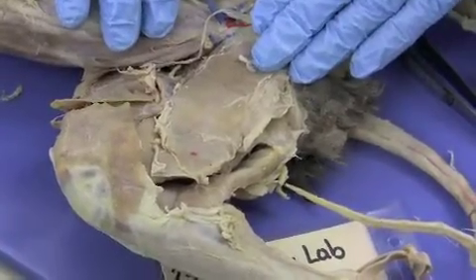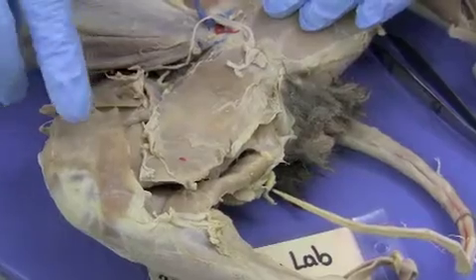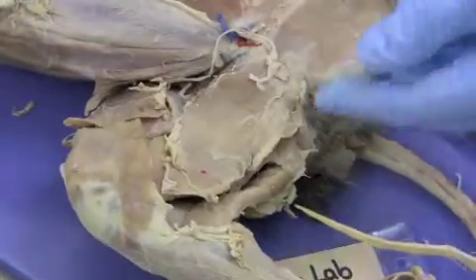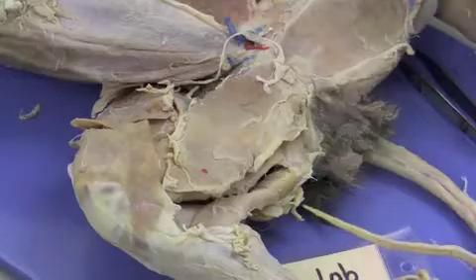We're looking at the medial side of the cat's leg, and there are two superficial muscles here. The sartorius, which is called the tailor's muscle because it helps you sit cross-legged like tailors had to. And this is the gracilis muscle, and it helps you adduct your thigh.